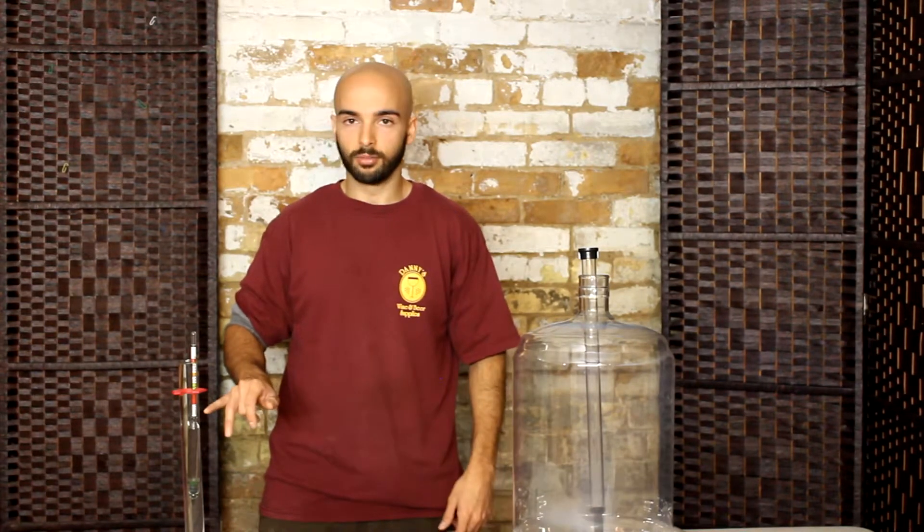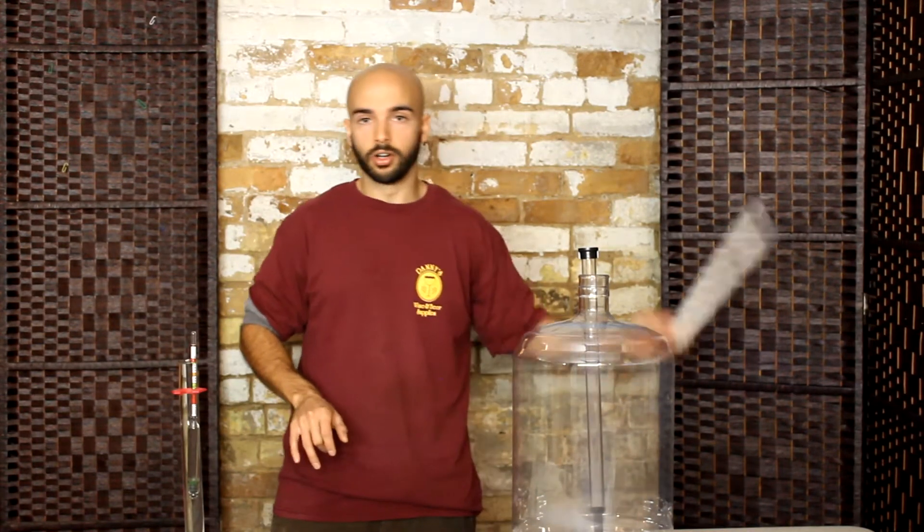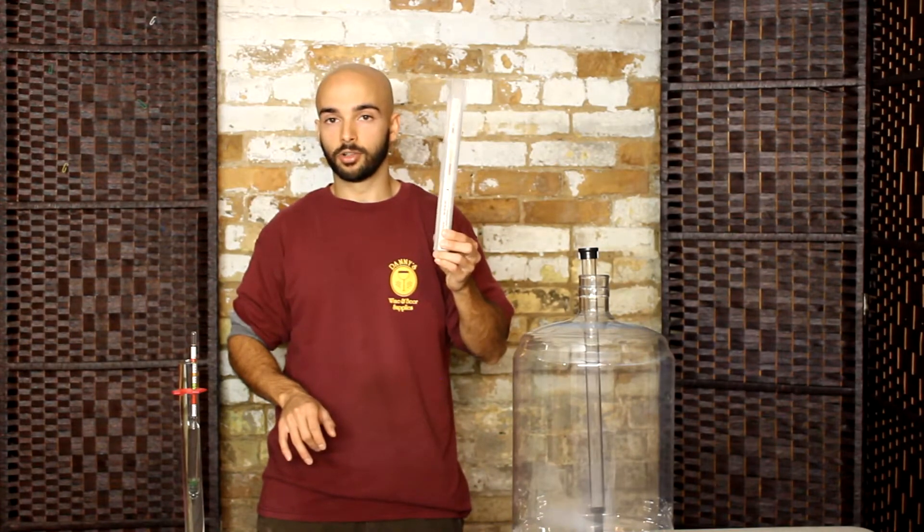Most hydrometers, like this one, are calibrated to take measurements at 20 degrees Celsius. So if your wine or your beer is hotter or colder than that it'll throw off the reading. Usually this can be accounted for with a formula that's going to be printed right onto the hydrometer or it'll be in the instructions that the hydrometer comes with.